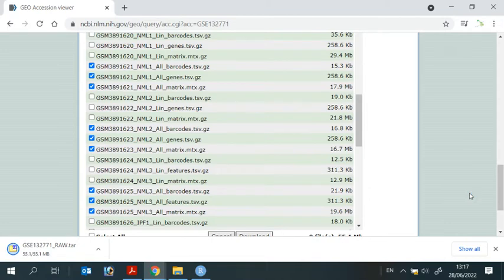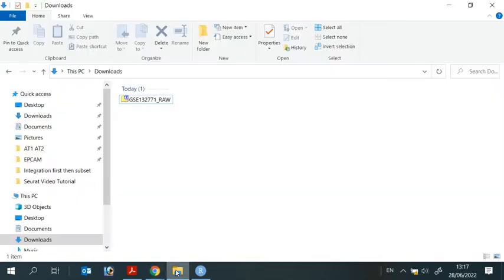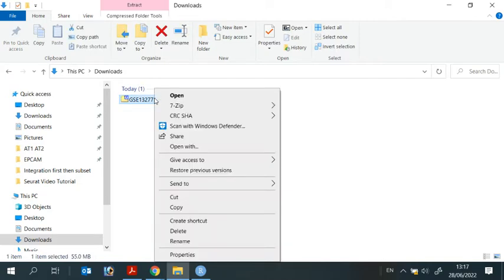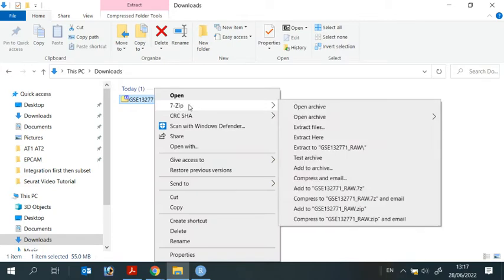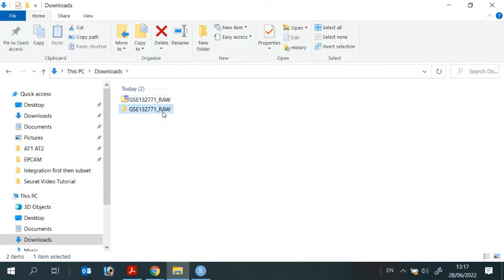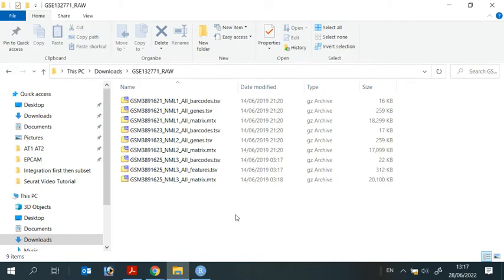Okay, downloading was finished. We can go to the download folder. At the moment, they are compressed into one zip file. We can unzip it with seven zip. You can do this in R, but for a beginner, this way is much easier to understand.